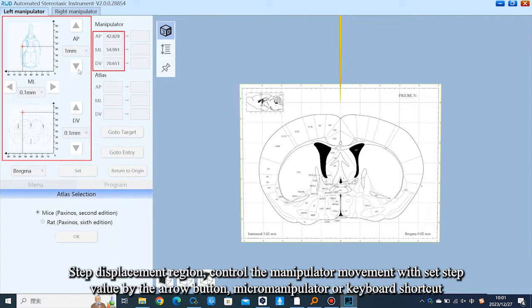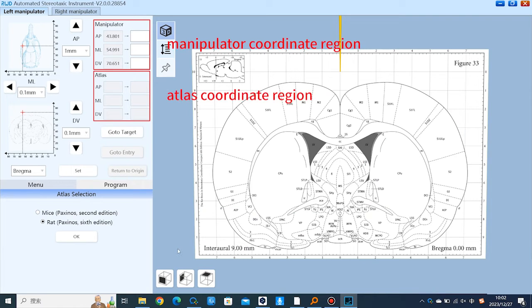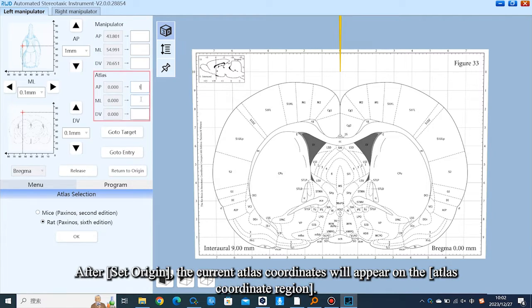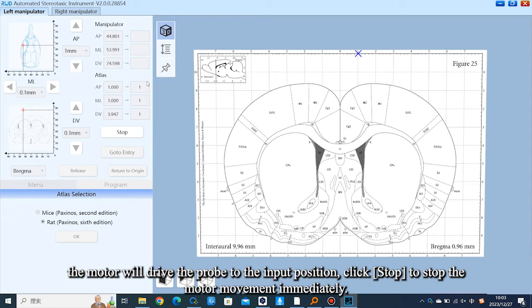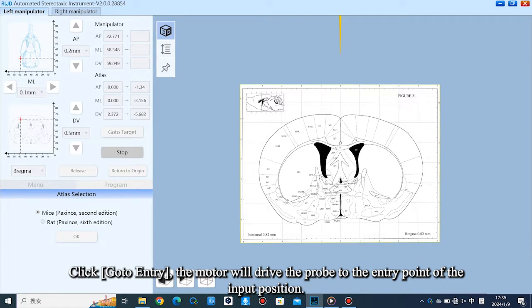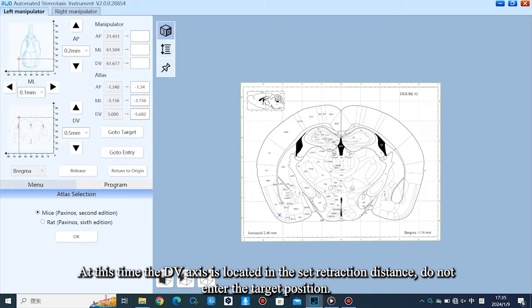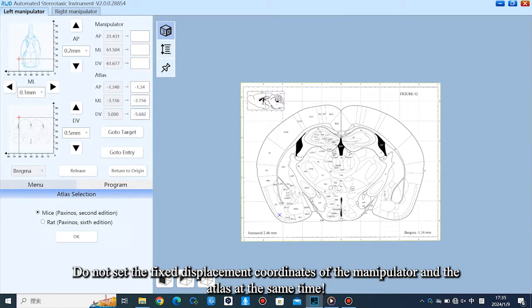The step displacement region controls the manipulator movement with a set step value using the arrow buttons, micromanipulator, or keyboard shortcuts — refer to the table for details. After frame calibration, real-time readout coordinates appear in the manipulator coordinate region. After setting the origin, the current ATLAS coordinates appear in the ATLAS coordinate region. Enter the objective coordinate in the box and click Go to Target — the motor will drive the probe to the input position. Click Stop to stop the motor immediately. Click Go to Entry — the motor drives the probe to the entry point, where the DV axis is at the set retraction distance without reaching the target position. Note: Go to Entry is only for ATLAS coordinates. Do not set fixed displacement coordinates of the manipulator and ATLAS simultaneously.